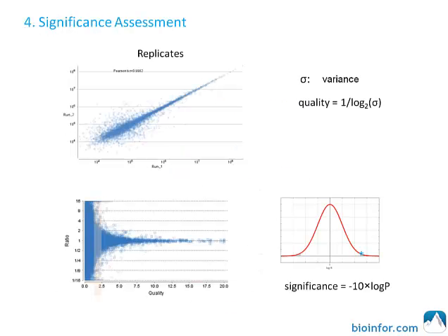Next, we make the significance assessment. Technical replicates are used to evaluate the variation of a feature between runs. A quality value is associated with a feature in terms of its intensity, isotope, and elution patterns.